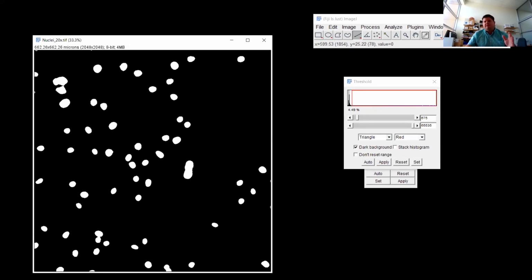If I wanted to get rid of everything that wasn't a nuclei in the green image so that I could just measure the nuclei and say what the intensities were, I could multiply my mask image by my GFP image, for example. If you multiply anything by 1 or 0, the 0 will be ignored, so the background will be taken away, and only the objects that I'd be interested in will be kept as 1 to then go and do the next step of the analysis. So that's what I was referring to with the math step there. Oh, okay, thank you. That's okay.